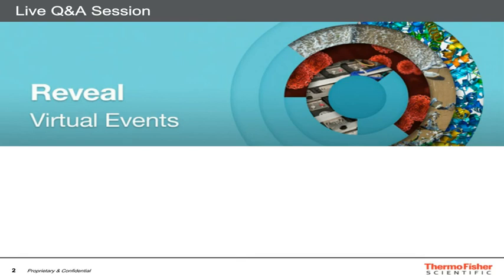Great. The next question, I think that's for you, Raphael. What about the matrix effect when using XRF on thin films, a sample with multi-thin layers?